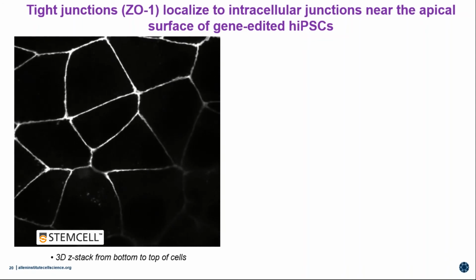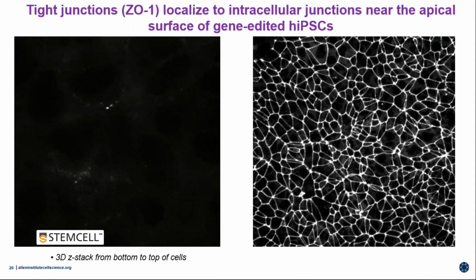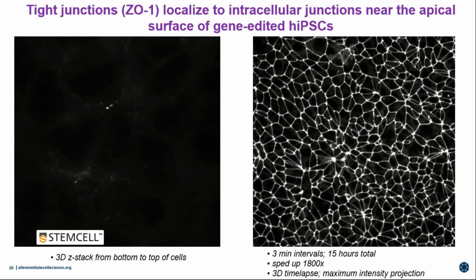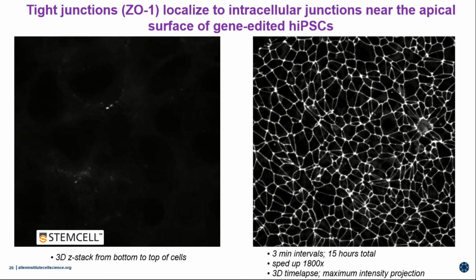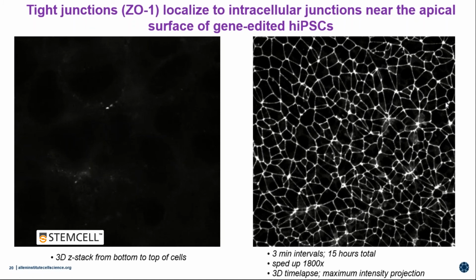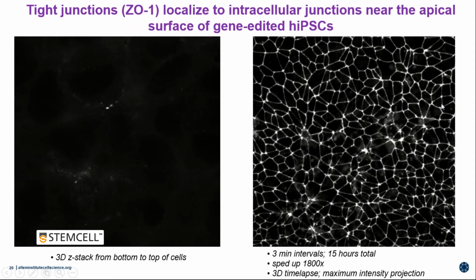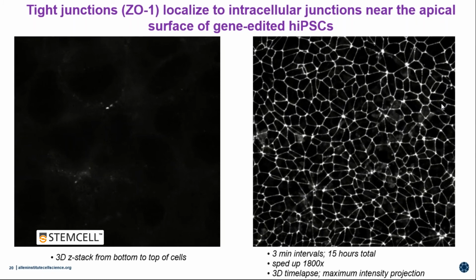And on the right is a lower magnification, but it's a time lapse. And I think we imaged this just a few weeks ago, and I had no idea. So you can see how dynamic this colony is, and all colonies are. And you can see maybe on the top right, my pointer may not work, some of these tight junctions release. It turns out the dead cells in the colony are being ejected. And that's what you're seeing with some of the stain going away and coming back.